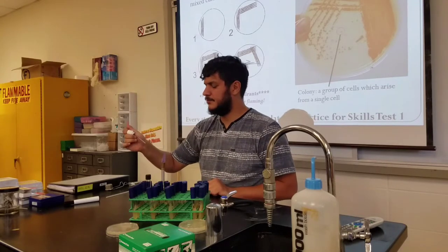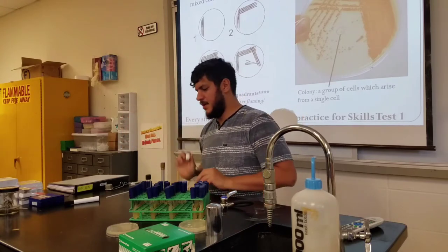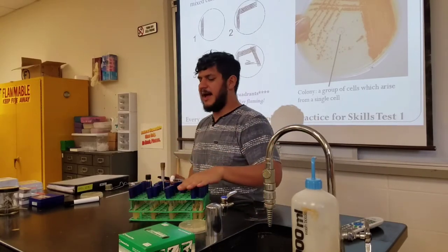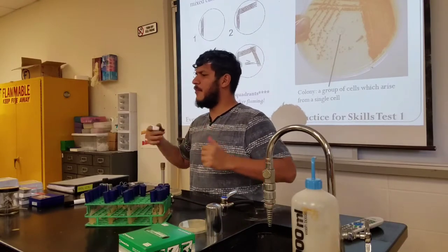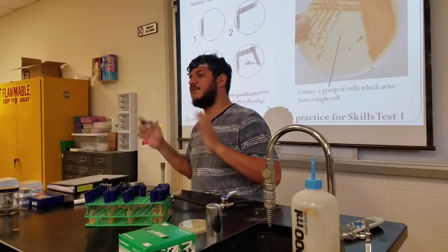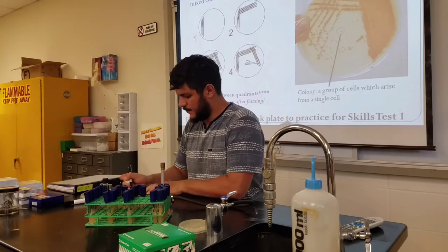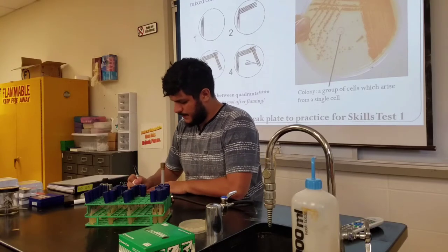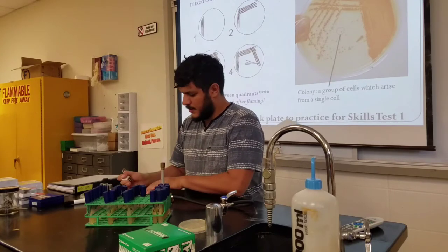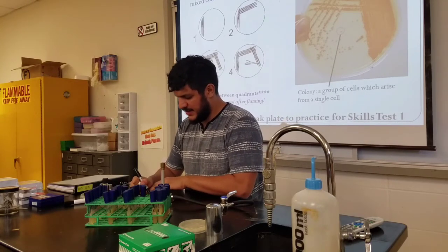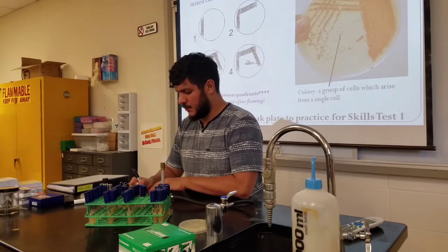Alright, that is a proper slant to plate transfer. The third live demo before you go to work is isolation by streaking. Isolation streaking is just a modified slant-to-plate transfer. We are going to start with a proper label — I'm going to put the technique on this one because that is my objective — and I'm doing a streaking of Micrococcus roseus plus Micrococcus luteus.